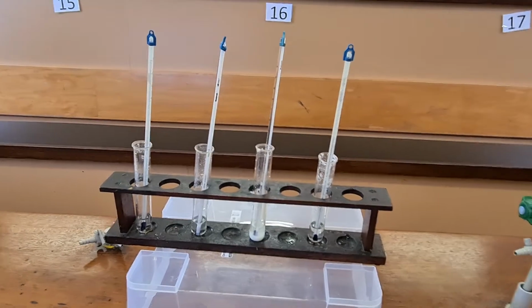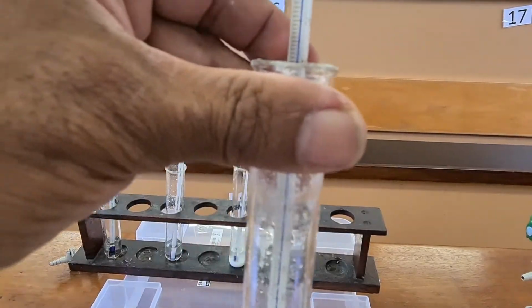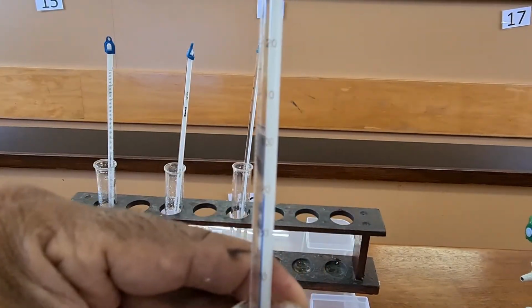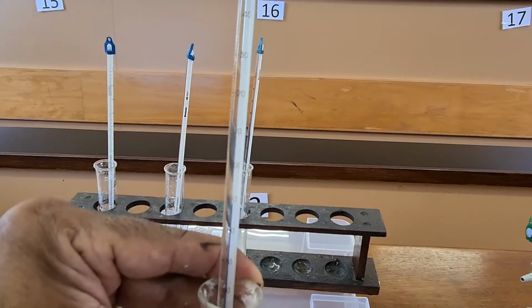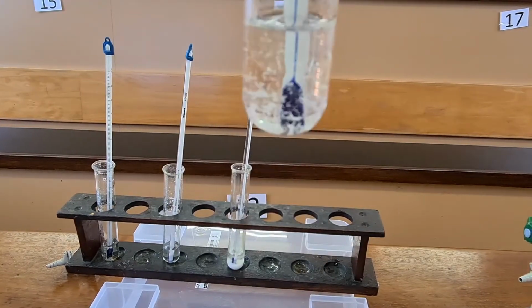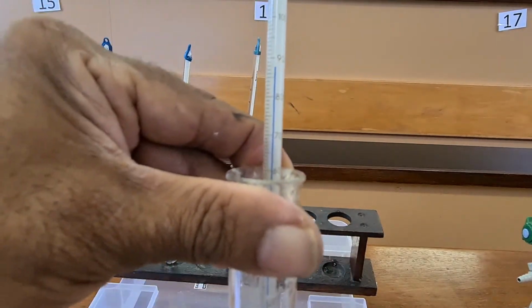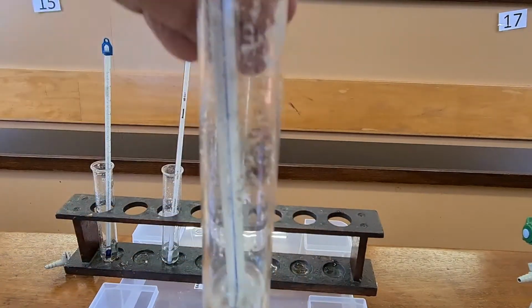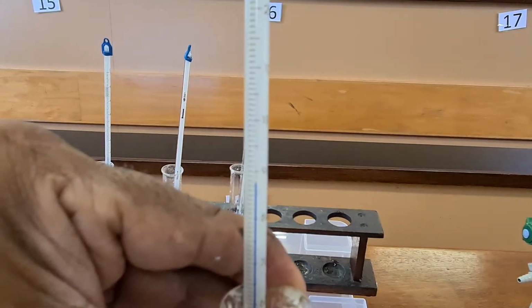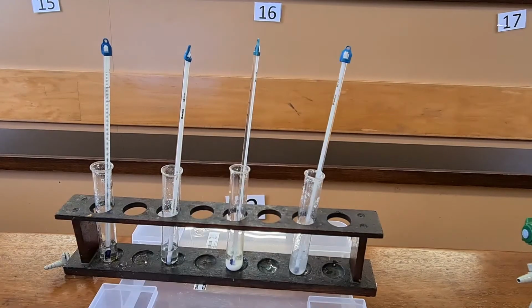And I'm going to look to see when the others start to crystallize. Now the temperature here on the fourth one is at 90 degrees. There, it's starting to form. Look, crystals starting to crystallize at 88 degrees. Can you see that? The first signs of crystals came out at 88 degrees. So D was 88 degrees Celsius.